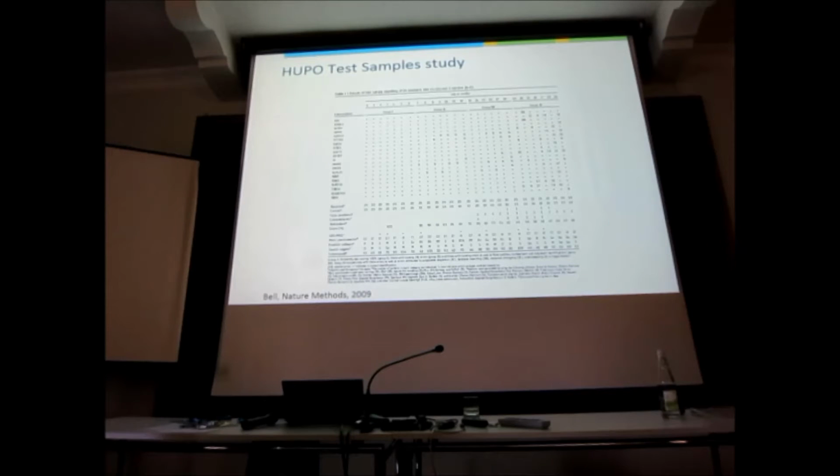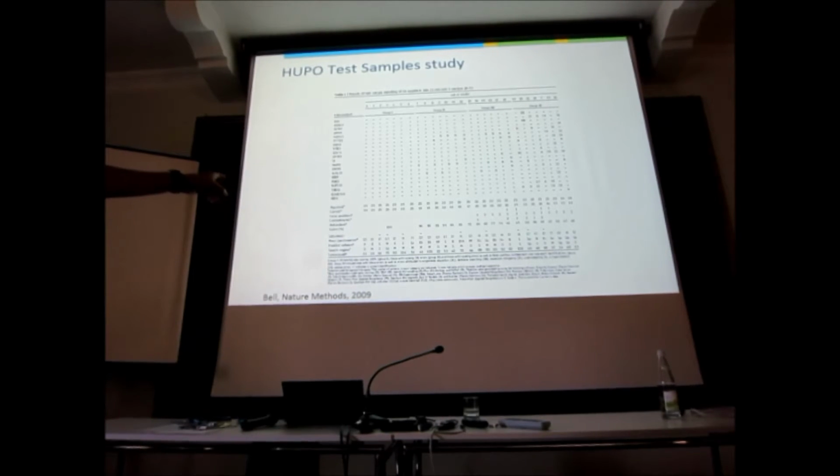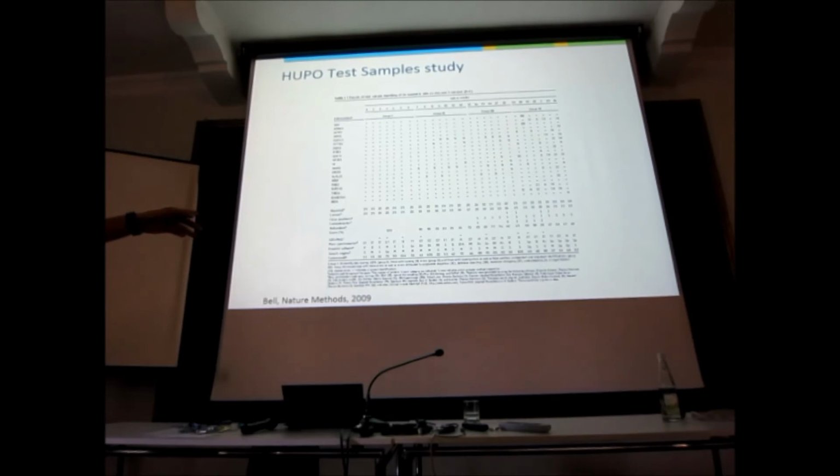Right? Okay, let's have a brief history of some attempts at quality control in proteomics. I'll start with the one, I'm a co-author on this one, and I really don't like this. The reason why I don't like this is this table. I can show you the email fights I had with the principal authors, me and a few other bioinformaticians. This is a flawed representation. It gets huge amounts of citations though. This is the HUPO test sample study.